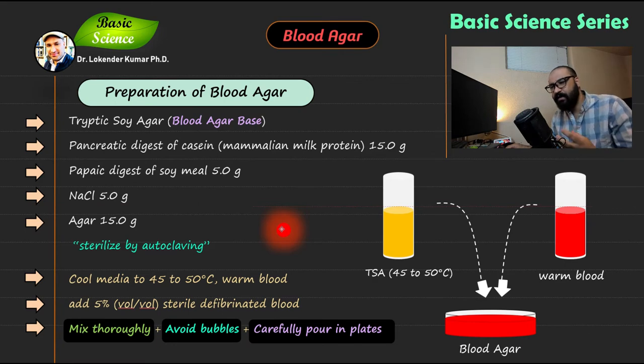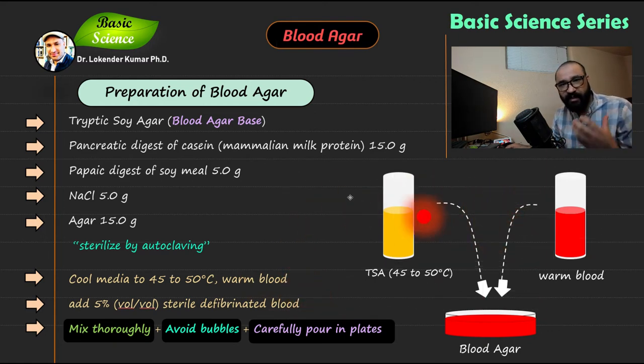The next step is adding 5% sterile defibrinated blood. You can buy defibrinated blood from various companies. You will use mammalian defibrinated blood — human defibrinated blood is prohibited because of human blood-borne pathogens. Most likely you are going to buy sheep defibrinated blood and mix it with the blood agar base, which in this case is tryptic soya agar.